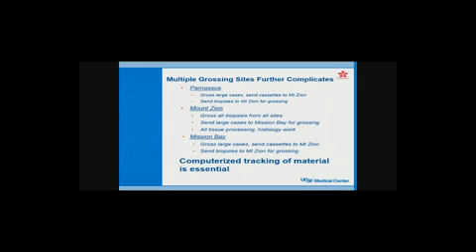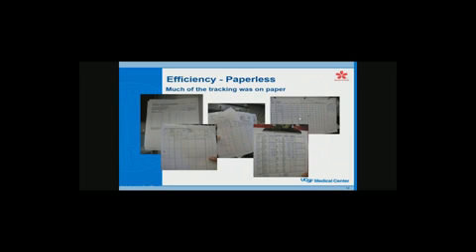But for instance, at the Parnassus campus, they'll gross large cases, transplants, things of that sort. They send all the cassettes to Mount Zion. They send all the biopsies to Mount Zion for grossing. And then Mission Bay is where they gross all the large cases. For instance, Mount Zion gets large cases, but they send them all to Mission Bay to be grossed, and those cassettes go back to Mount Zion for histology processing.